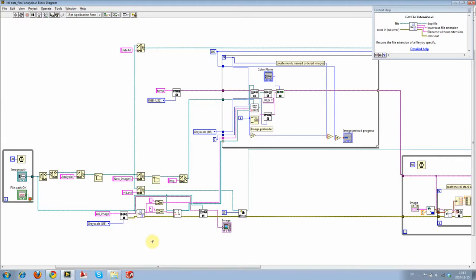All files which have the same file extension as the one that was chosen will be analyzed. This does not work if we have to do a filter first for, let's say, the confocal data, which is C800. Then we'll have to add an extra component there. This is just to show you another way of doing it. So we construct all these folders and file locations, etc.